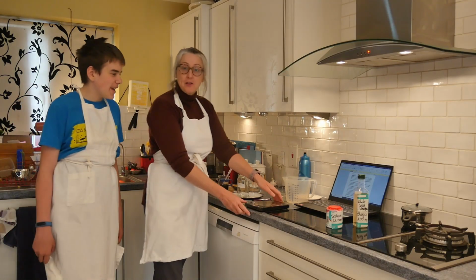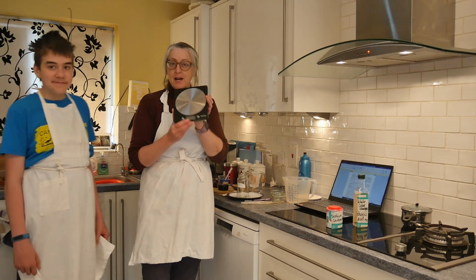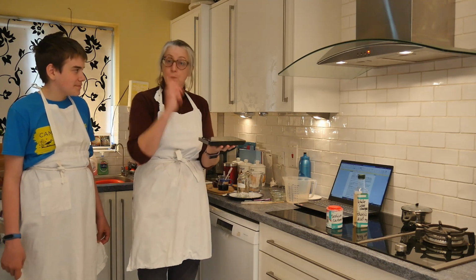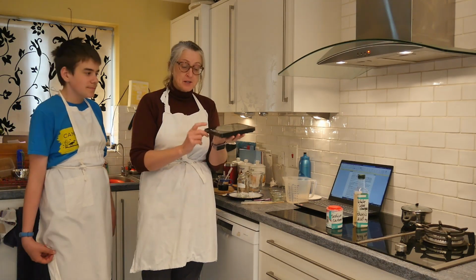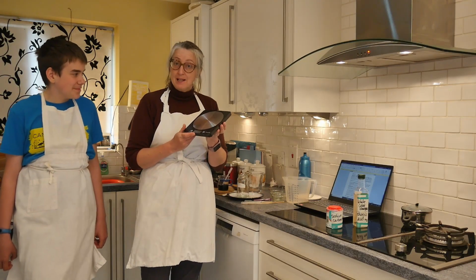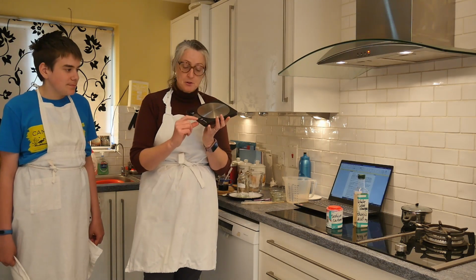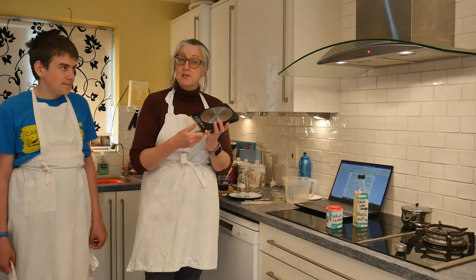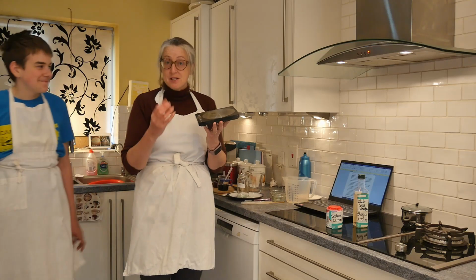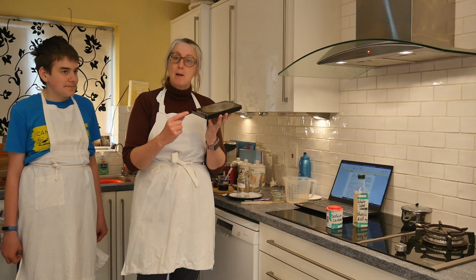Okay. So other things that you might find useful. Electronic scales are really good, because these weigh to 1 gram. Okay, so that's 1 gram units. Now that is accurate to 1 milliliter. And you do need to set your units to grams before you start, so check your units button and make sure that it's set to grams. Now even if you're working in the US where you use fluid ounces and stuff, your scales should be able to set to grams, okay?